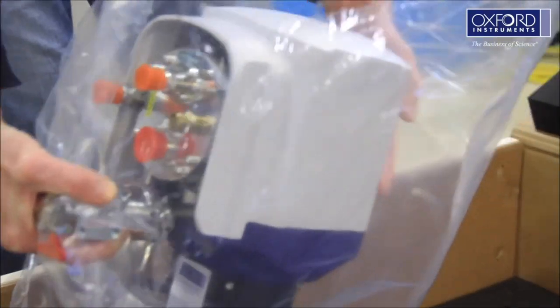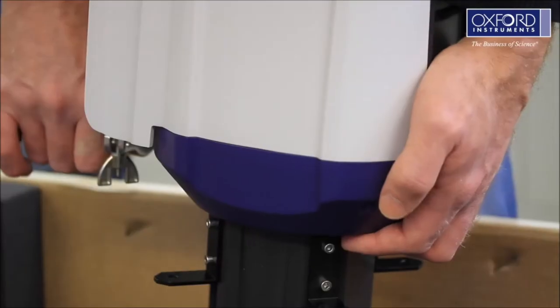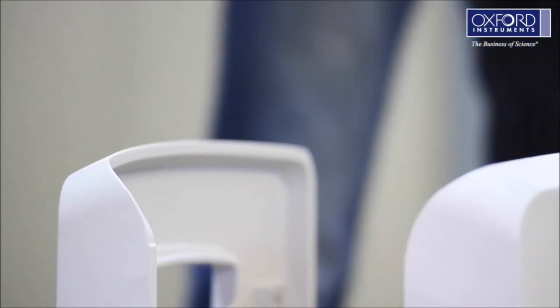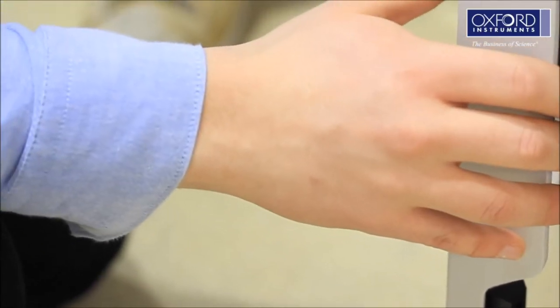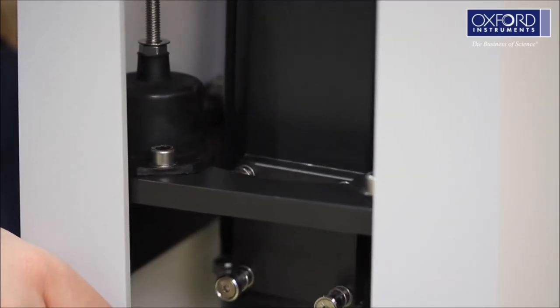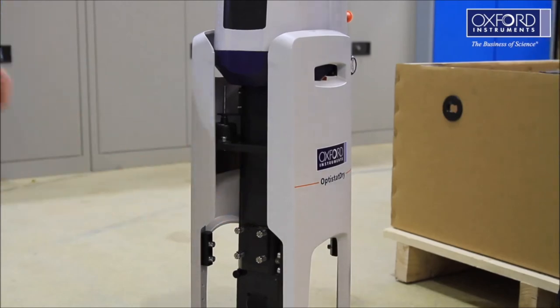Remove the cryostat from the plastic bag and lift it out of the box. Take care as this is heavy and should not be lifted by the plastic dust cover. Load the cryostat into the stand — it is recommended that two people do this operation, one lifting and fitting the cryostat, the other guiding it into position. Take care not to knock the pressure relief valve as you lower the cryostat. The cryostat will only fit one way around into the stand.